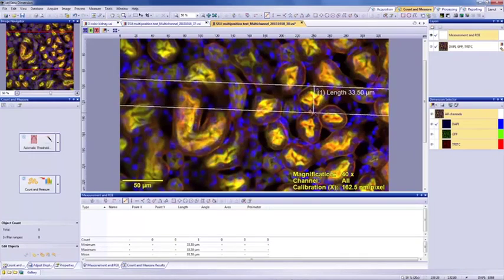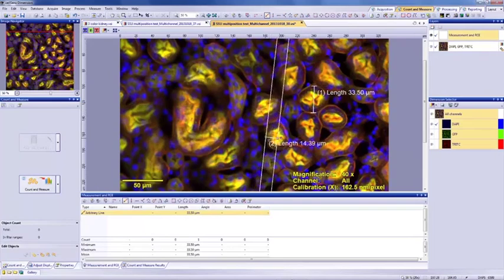All of these features mean that quantitative measurements, such as length, become easy to perform and dependable.